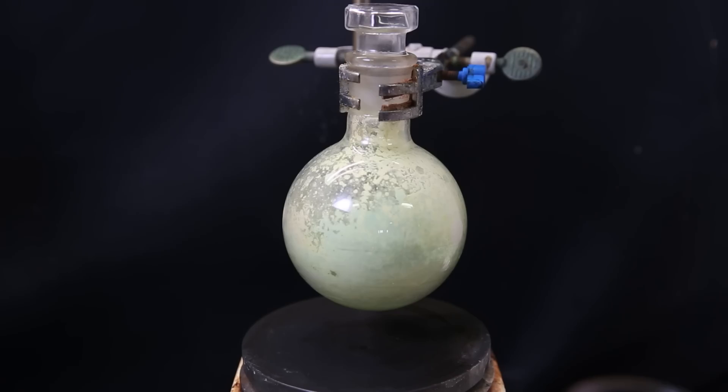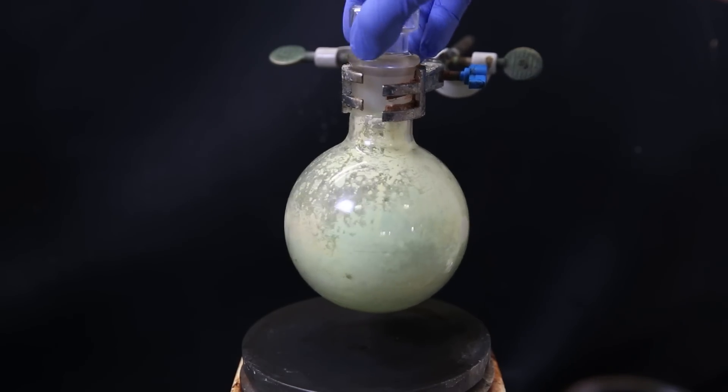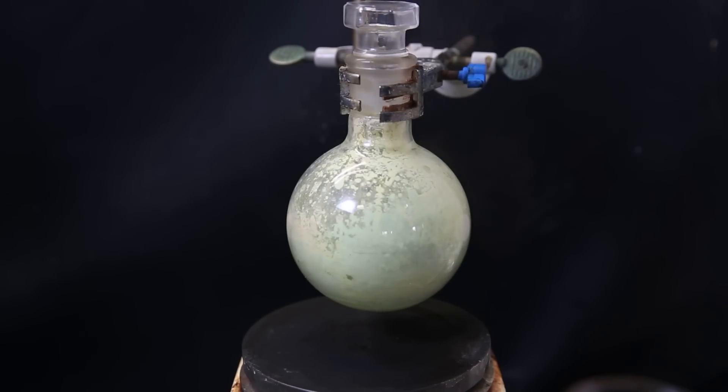After letting the flask sit closed for two days, the color seemed to change dramatically. Uranium tetrachloride reacts with moisture from the air, but it should be very limited in a closed flask, so it probably looks more dramatic than it really is. When I remove the stopper, some hydrogen chloride gas quickly pops out, so for sure a tiny bit has reacted.